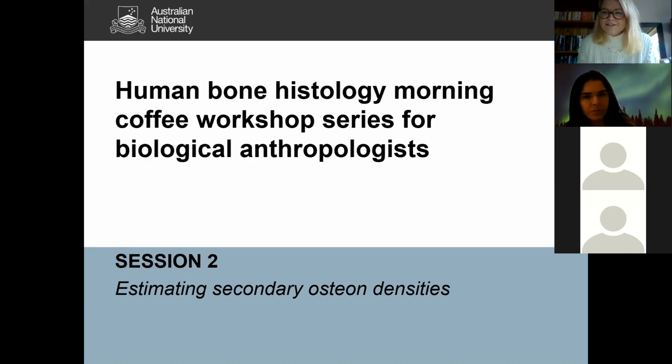So welcome to session 2. And today we will take a look at estimating secondary osteon density.